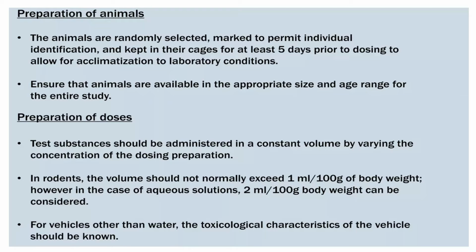The preparation of animals. Animals are randomly selected, marked to permit individual identification and kept in their cage for at least 5 days prior to the dosing, to allow for acclimatization to laboratory conditions.